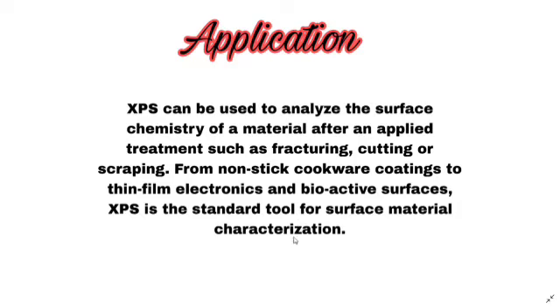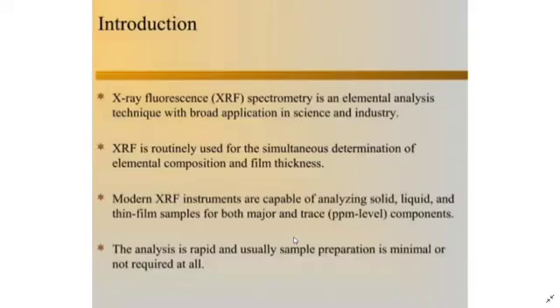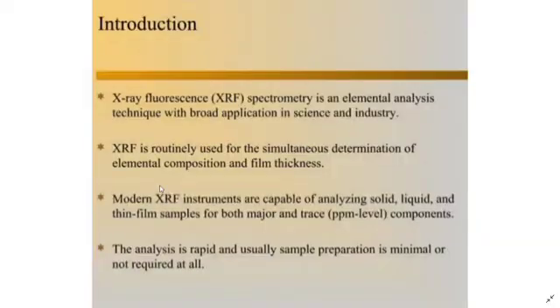Now we are going to see another technique, that is XRF technique. First of all, what is XRF technique? XRF, X-ray fluorescence spectrometry, is an elemental analysis technique with broad applications in science and industry. XRF is routinely used for simultaneous determination of elemental composition and film thickness.